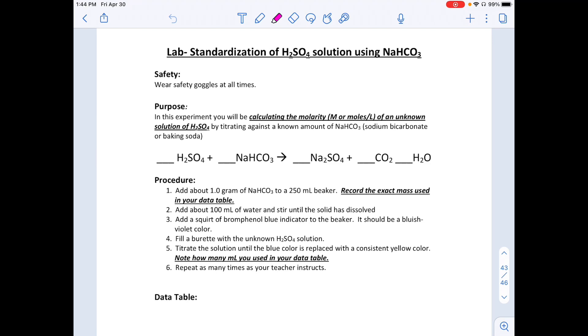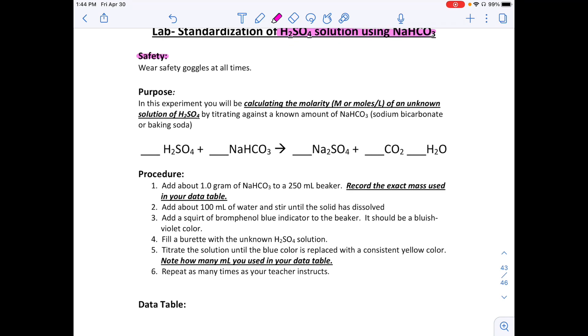This lab is about the standardization of sulfuric acid H₂SO₄ using baking soda — sodium bicarbonate. First, let's talk safety: sulfuric acid is a very strong skin and eye irritant, so make sure you wash your hands with soap and plenty of water if it gets on you. We also have bromphenol blue, which is an indicator made in a flammable solution, so be careful with that as well.